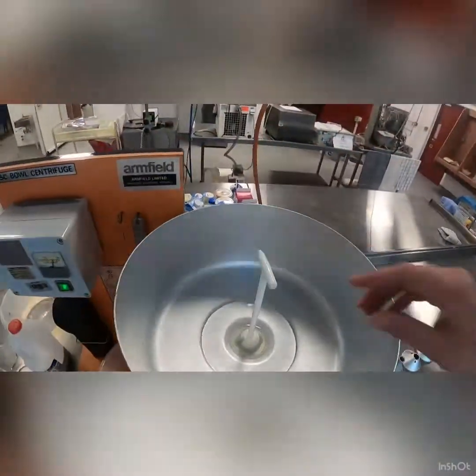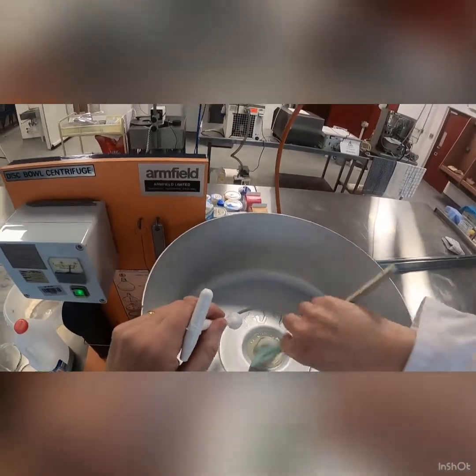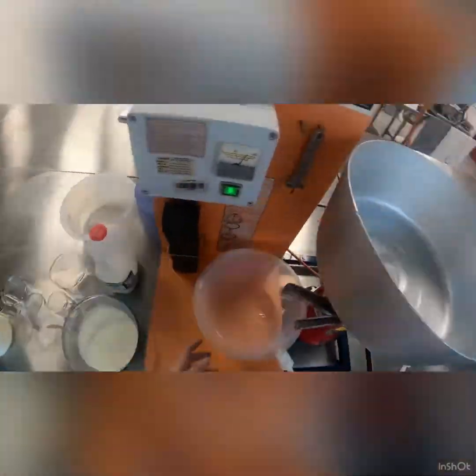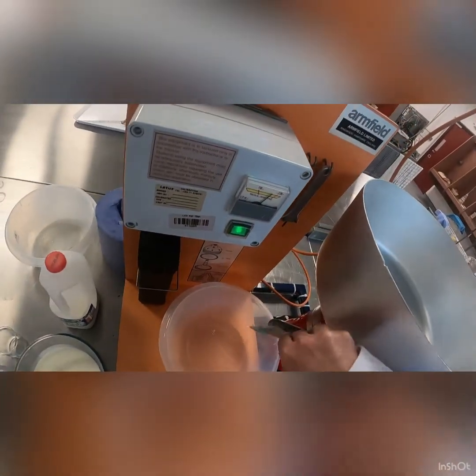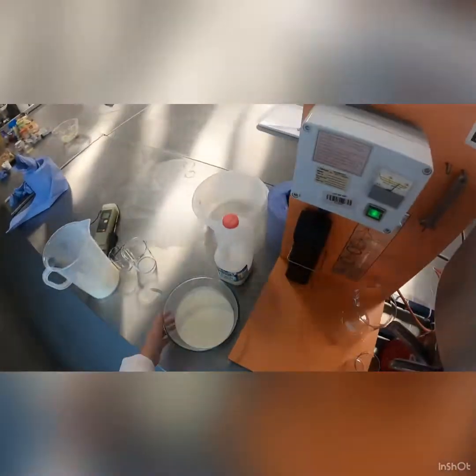Let's check — all the water is through and we are ready to proceed. We can take this away. Just catching the last bit of water coming out there, now we'll take that away and we are going to add in our milk.